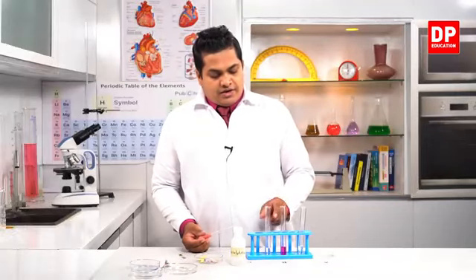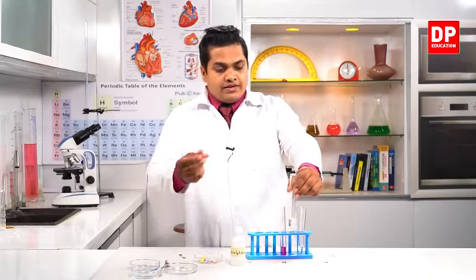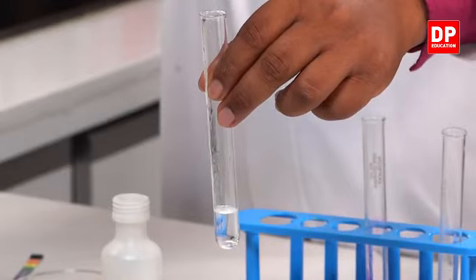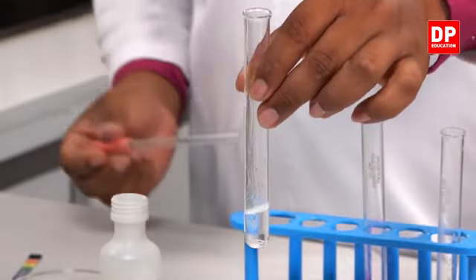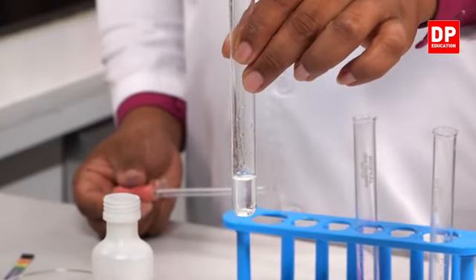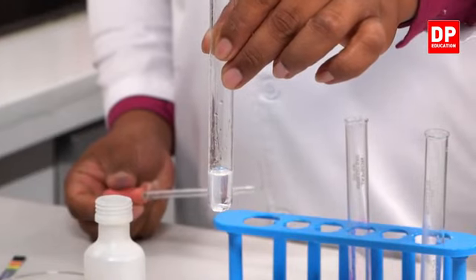So bases can convert this phenolphthalein indicator to a pink color from a colorless solution. Now the final one, the third one, sodium chloride solution. We'll add phenolphthalein to the sodium chloride as well. There is no observable change. It remains in the same color.